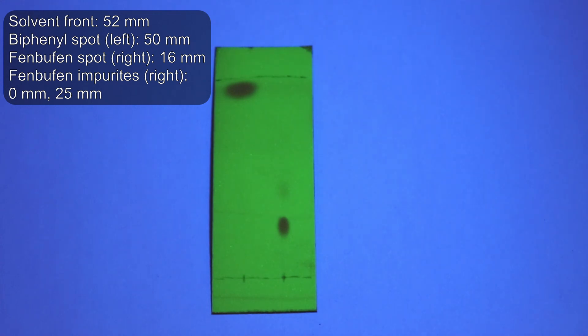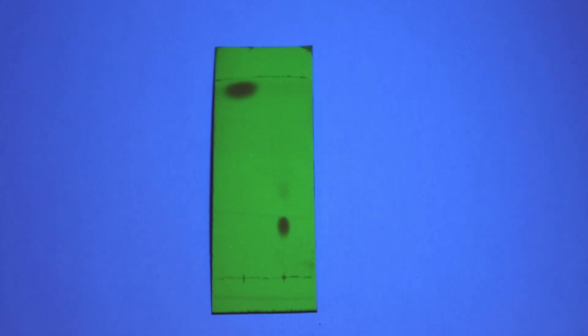It appears that the product I made has no residual biphenyl, though there is a tiny spot remaining on the spot line and also a very faint spot just above the main spot on the fenbufin, so there is a minor impurity present.